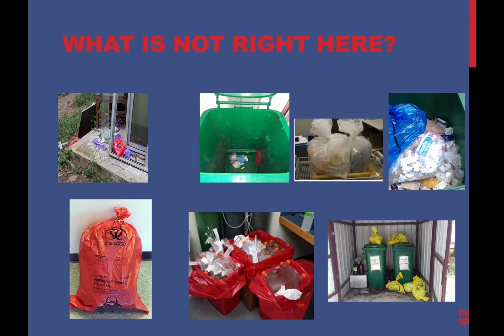Now the rightmost picture is this biohazard waste bin that has a blue bag, a white bag, some loose stuff. So this is absolutely not required. This is not allowed, and we need to throw only the designated biohazard waste bags. It has to be a yellow bag, and the waste has to be tied within the bag. We cannot discard it loosely, and we cannot discard it in any other plastic bag. So it has to be a biohazard bag.